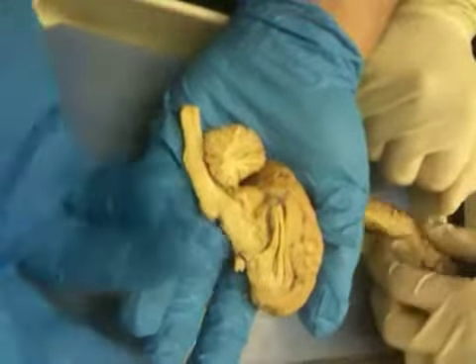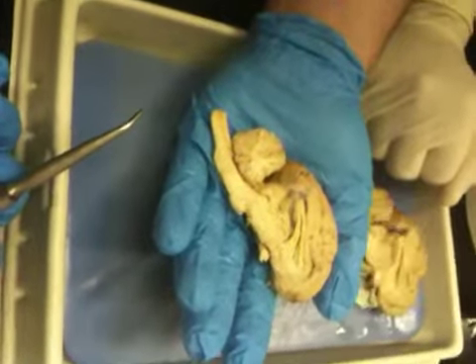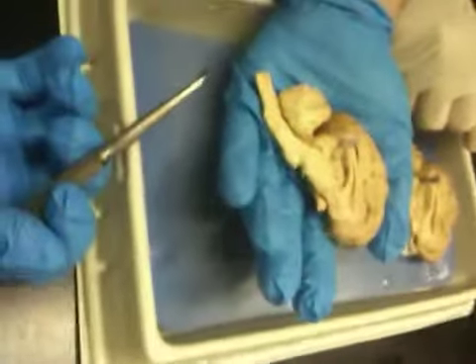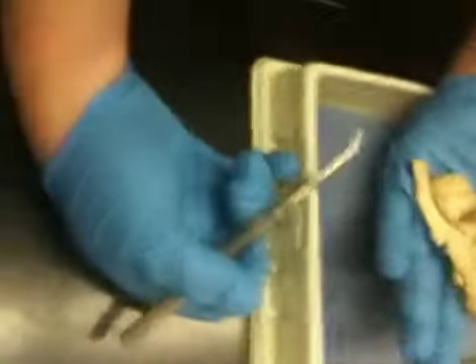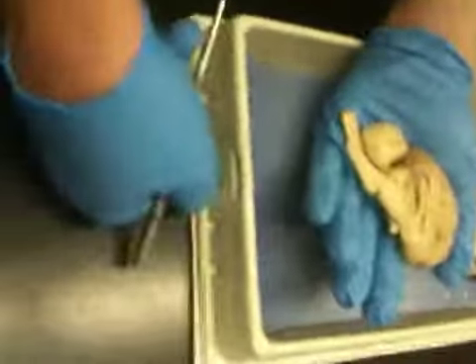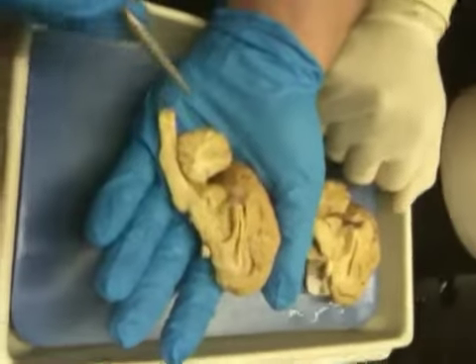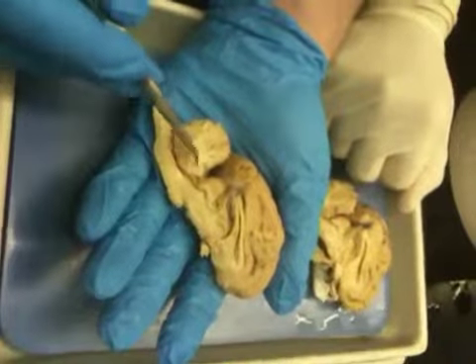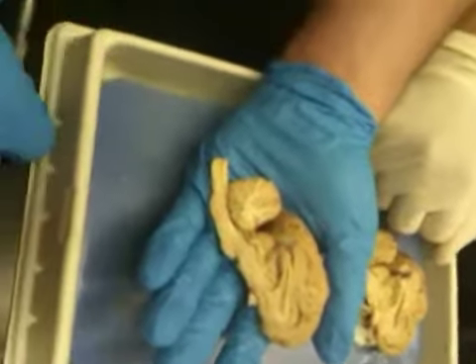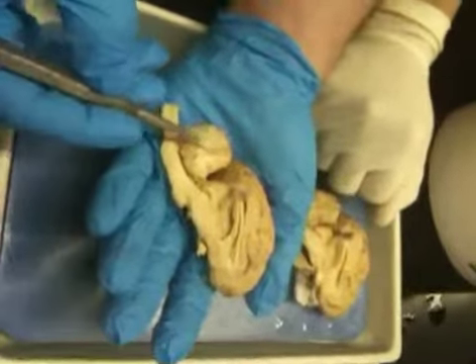That's what the book says. The vermis is composed of white matter. And the arbor vitae is pretty obvious. It's the tree of life, I think, in Latin. And this is all of these little branches of white matter, like the trunk. That's probably where they get the name. That includes the trunk. So this includes this then.